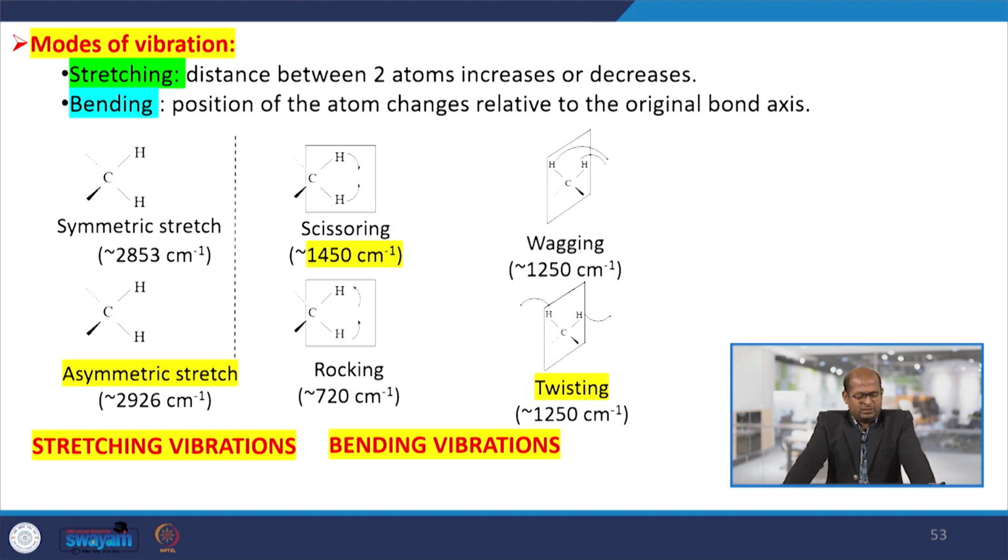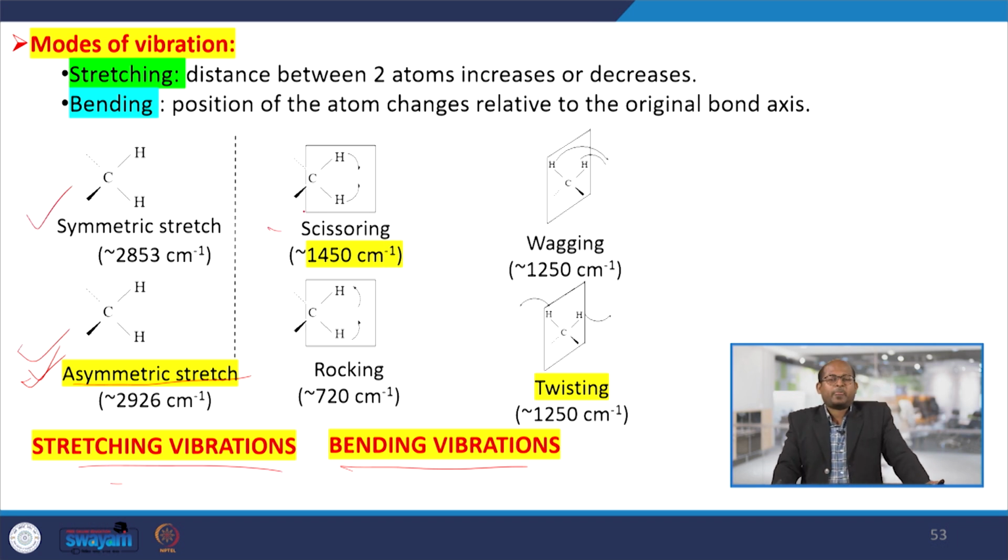There are asymmetric stretching, symmetric stretching, and bending when a molecule has different types of freedom. So when IR is incident over that material, that particular type of vibration would be there in those molecules or compounds, and depending upon the asymmetric stretchings, symmetric stretchings or bendings, we can get that and analyze that spectra.